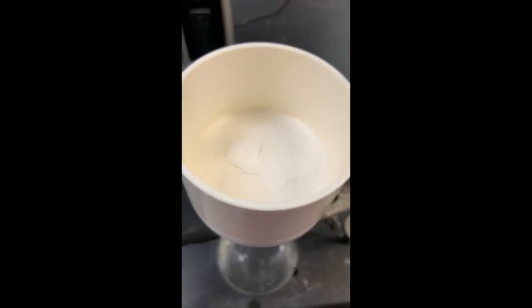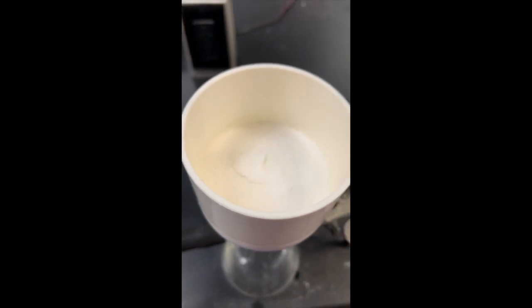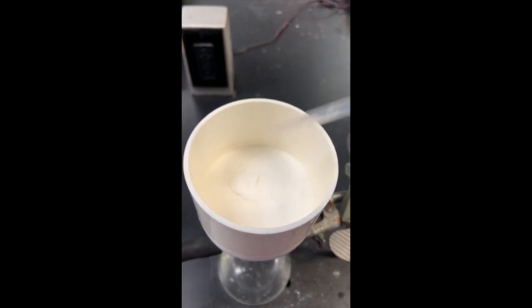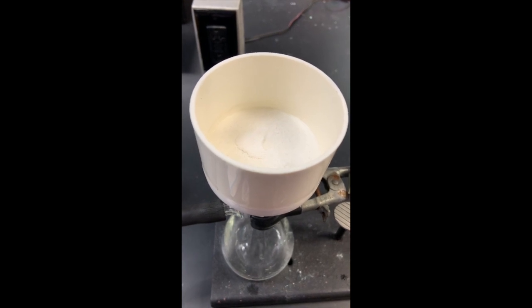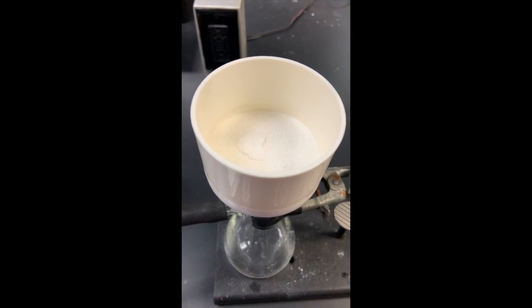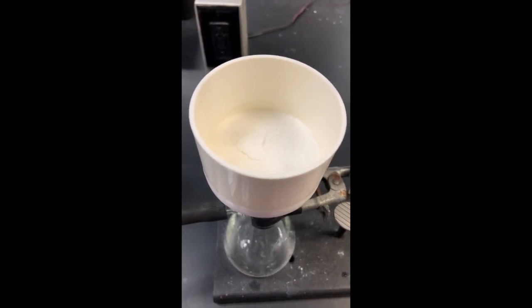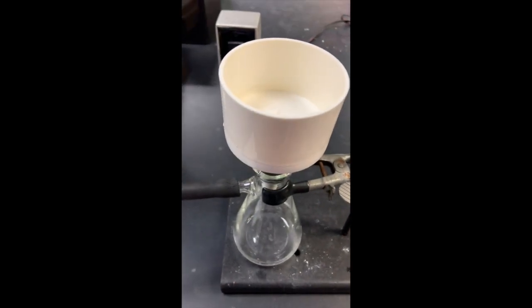I'm going to add a little bit more because the first pipette wasn't exactly 1 milliliter. So I'll add a couple more drops of my ice cold water. Now I'm going to let this sit for a little less than 10 minutes. So I'll do 8 minutes. I'll pause this video and check back in after 8 minutes of vacuum filtration.